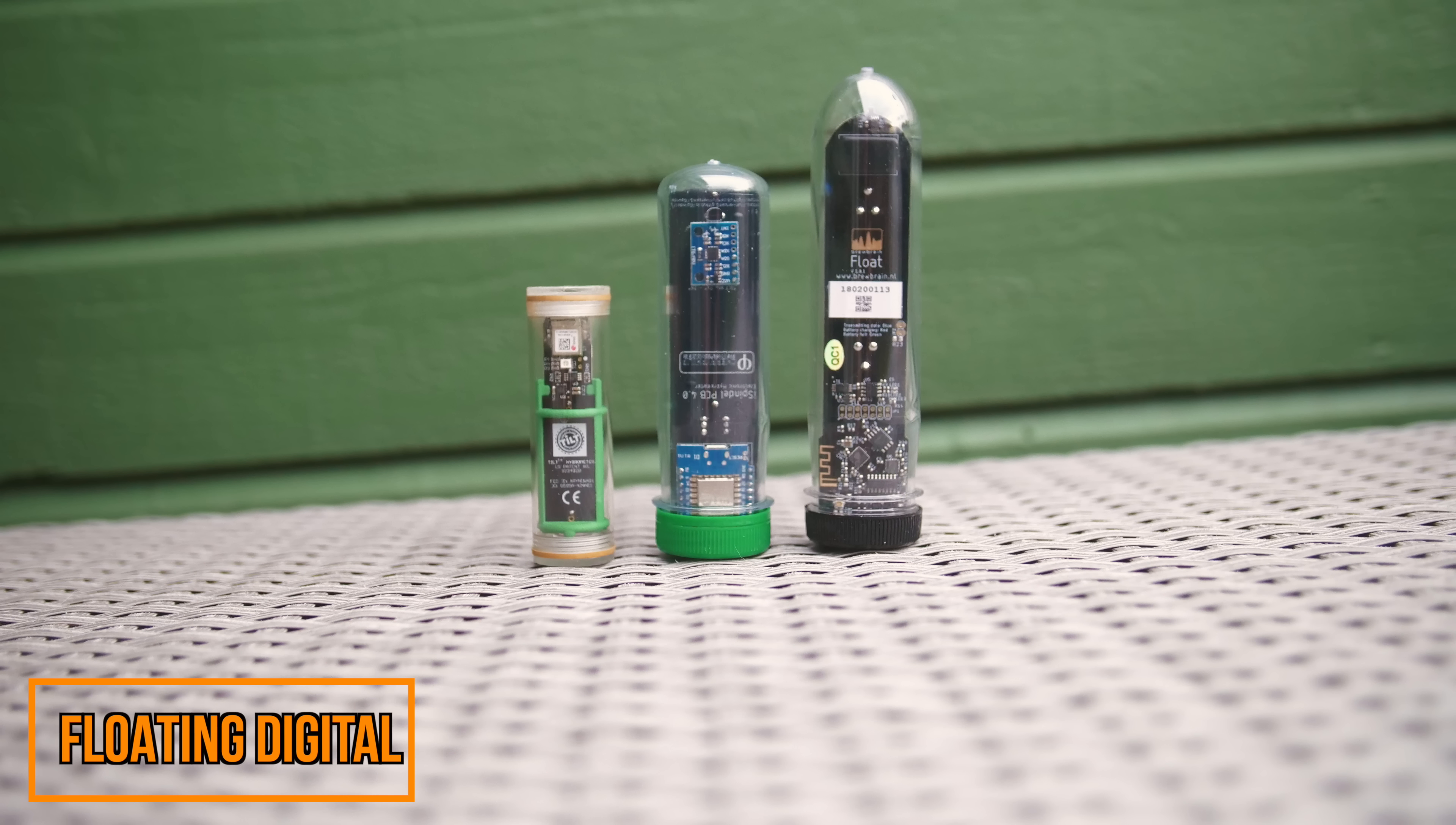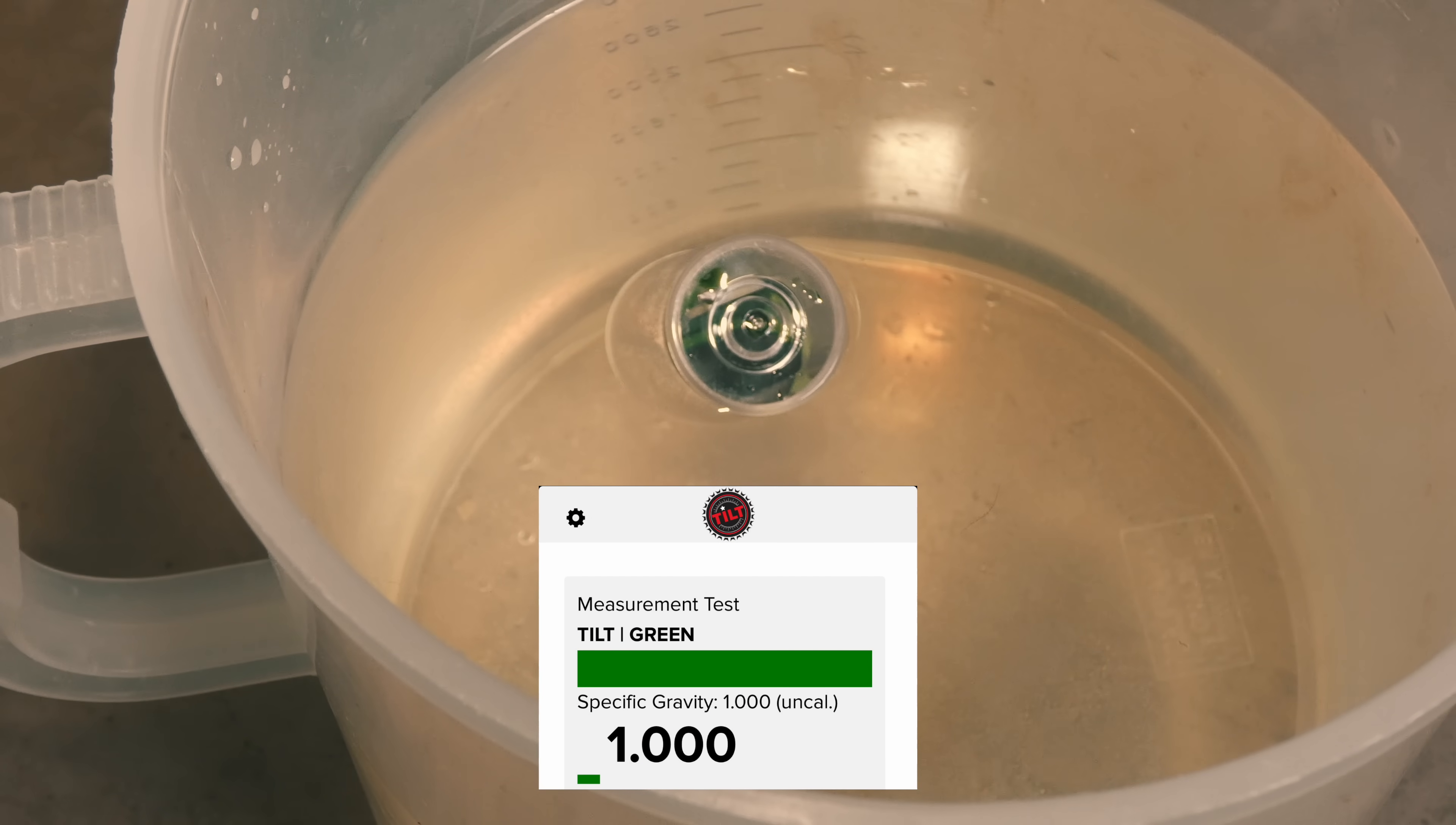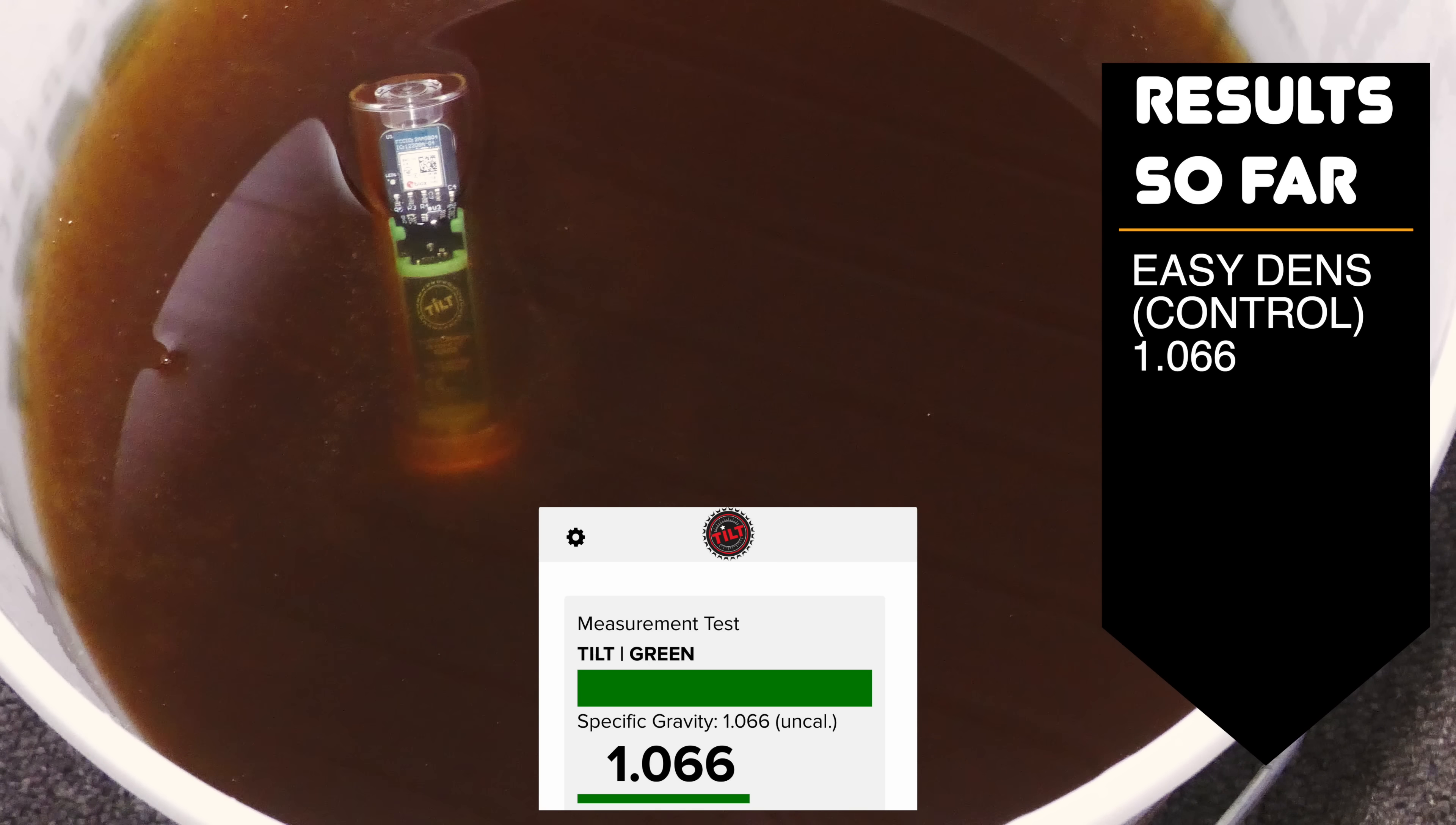I have done a lot of testing with floating digital hydrometers in the past and they are in and out of accuracy during fermentation. But I suspect that they will be much more accurate in a calm wort. So here goes testing with the latest version of the tilt. Before starting this test I wanted to check the calibration of the tilt in distilled water. The hardest part of this was actually getting the tilt to stay still quickly and it circled the container as if it was angry at being imprisoned for quite some time. As it turned out it was still spot on without any need for calibration. Once again there was a little dancing within the wort but the tilt stabilized quite quickly thankfully compared to in the distilled water. Once it did I then picked up the reading and boom it was the same as the EasyDens. I did have high hopes but I was surprised to see this level of accuracy.